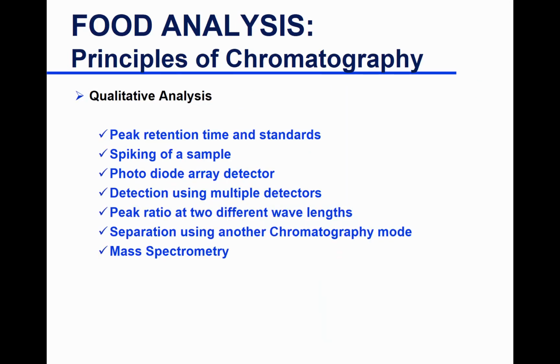So in chromatography, you have two types of analysis, qualitative and quantitative. So in qualitative analysis, what are you really trying to do when you are doing chromatography for qualitative purposes? Kim? To see if it's there. That's one form of qualitative analysis.